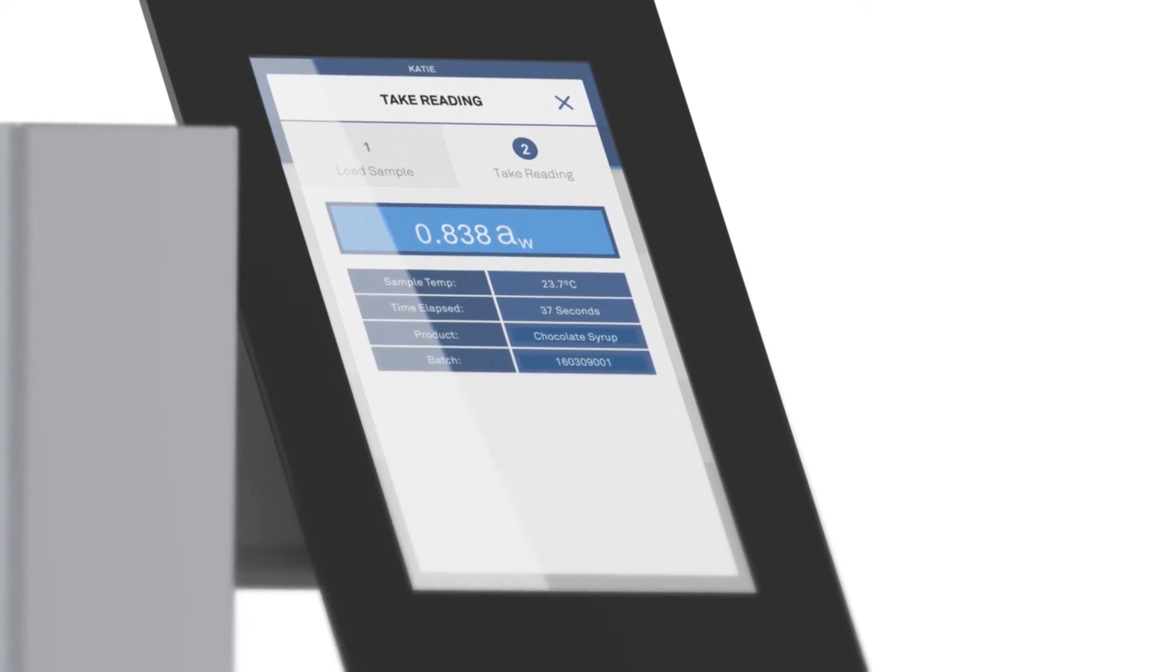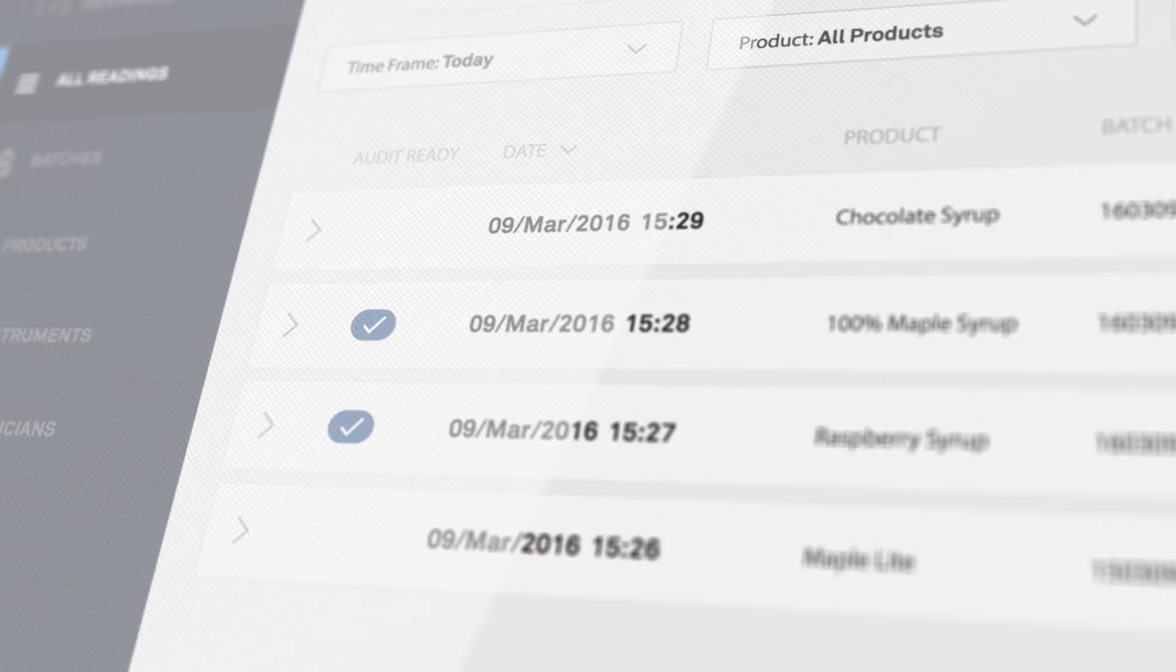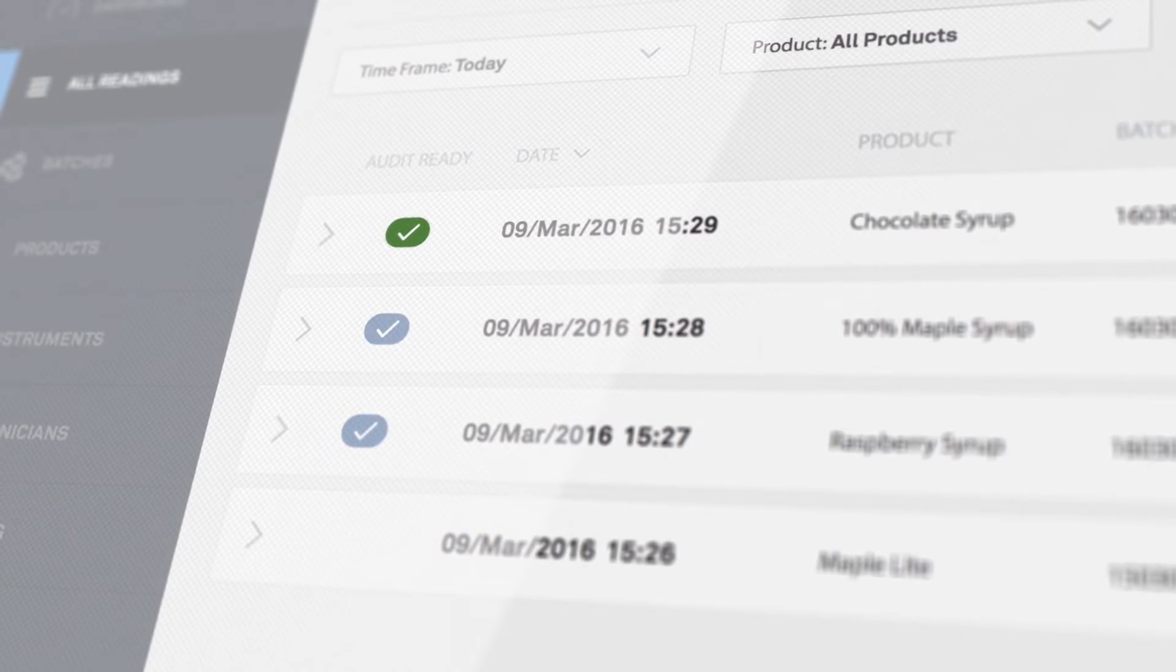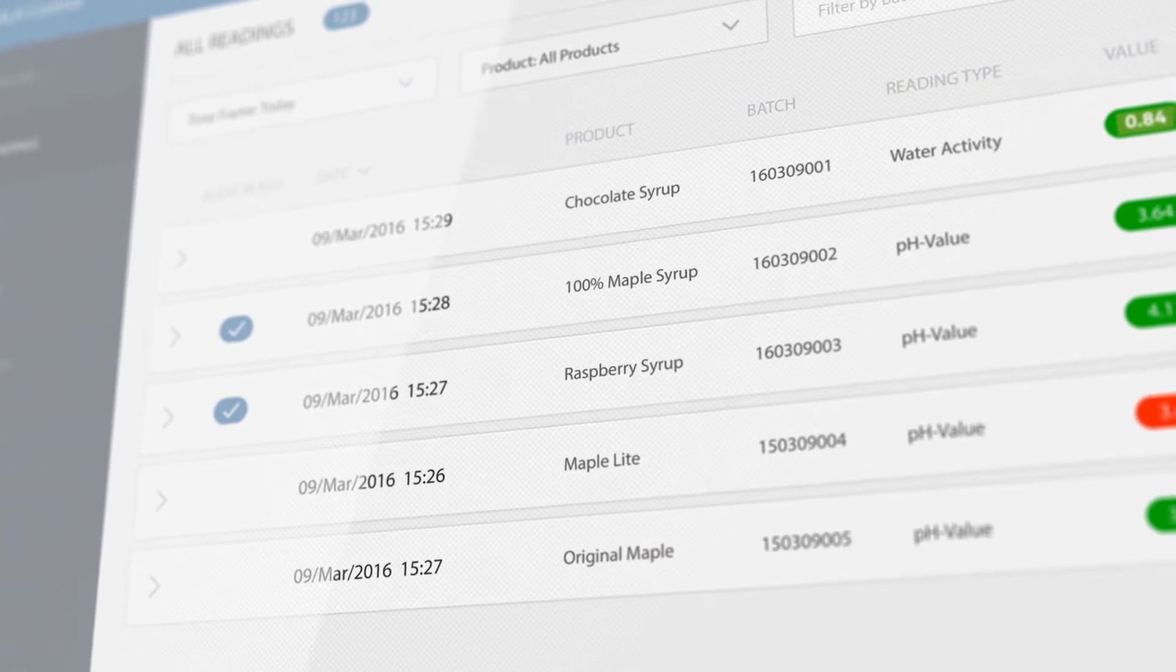We are running our verification in Scala, so the verification record can be attached to all the measurements we take this shift. But you can also record the details of your verification manually.